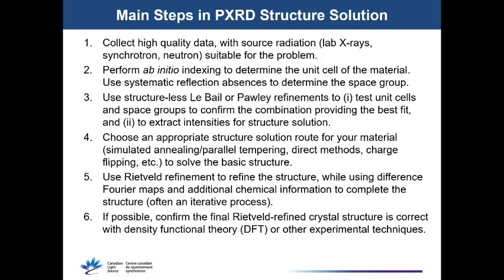So these are the main steps in structure solution. We'll be going through all of them in a little more detail. I already emphasized, you really want to get data that's sufficient for your task. Success in PXRD crystal structure solution is not guaranteed. So you want to give yourself every advantage you can to get to the right answer.